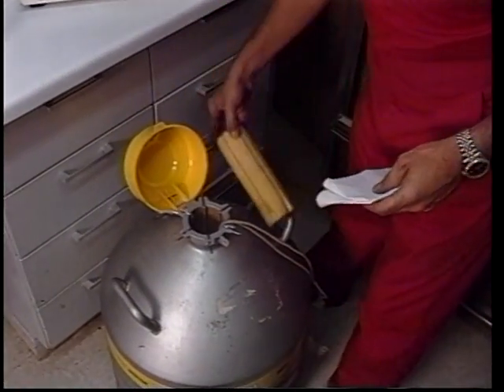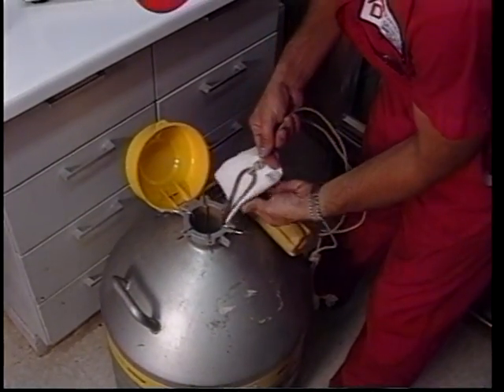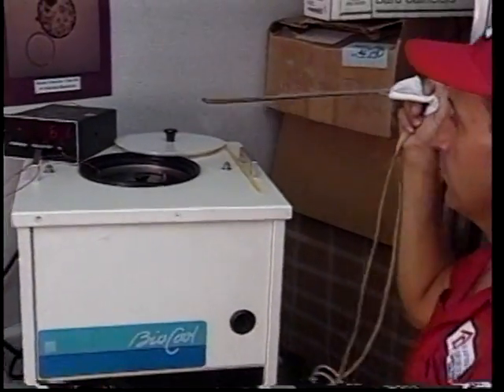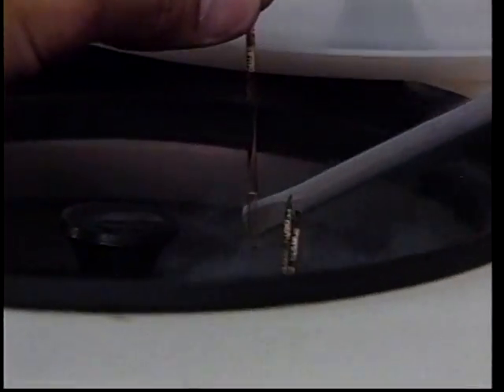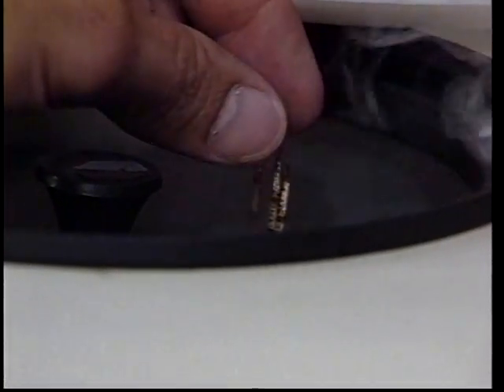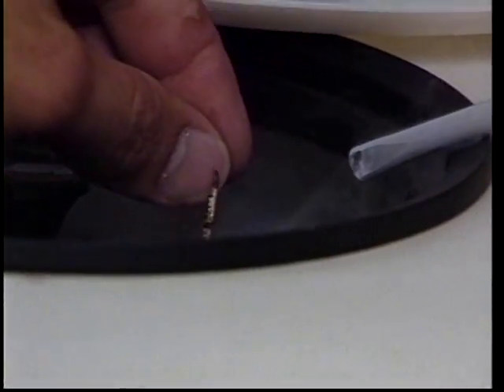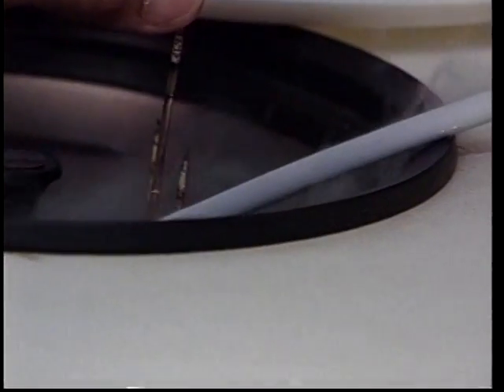Once the embryo straws have been in the freezer for 2 to 3 minutes, we need to induce ice crystal formation using the frozen brass rod. Care should be taken to hold the rod with a paper towel so that you do not burn yourself. Each straw needs to be raised individually, touch the band containing the embryo and the band above it. If you notice, a small bit of ice crystals will form. This is what we call seeding.